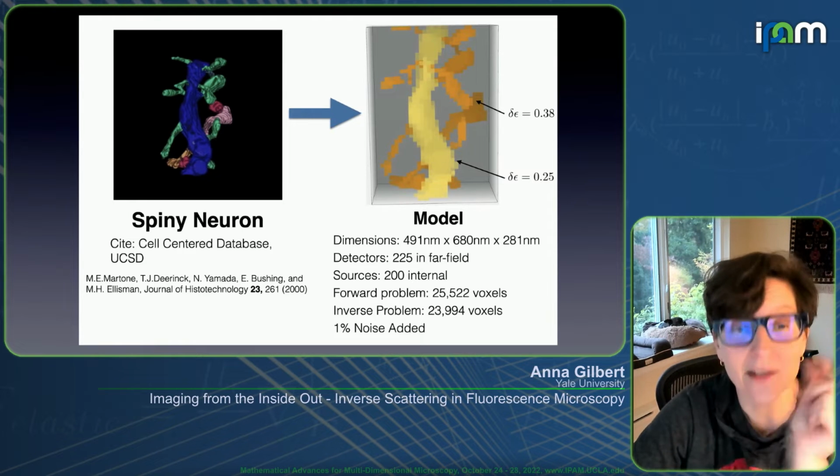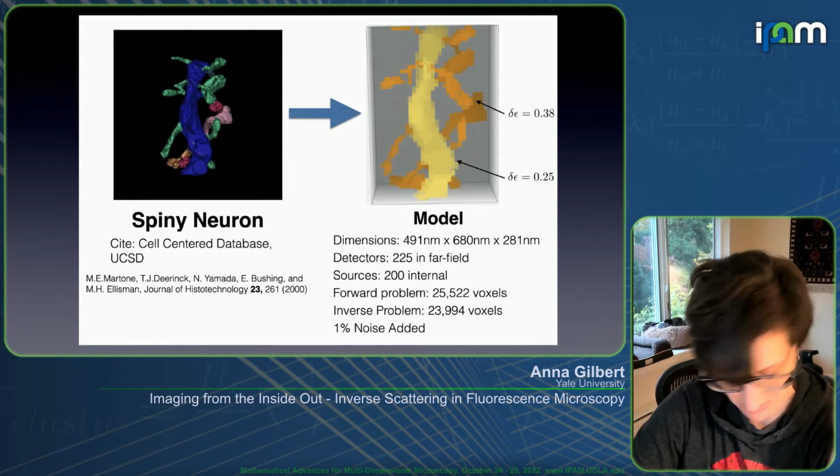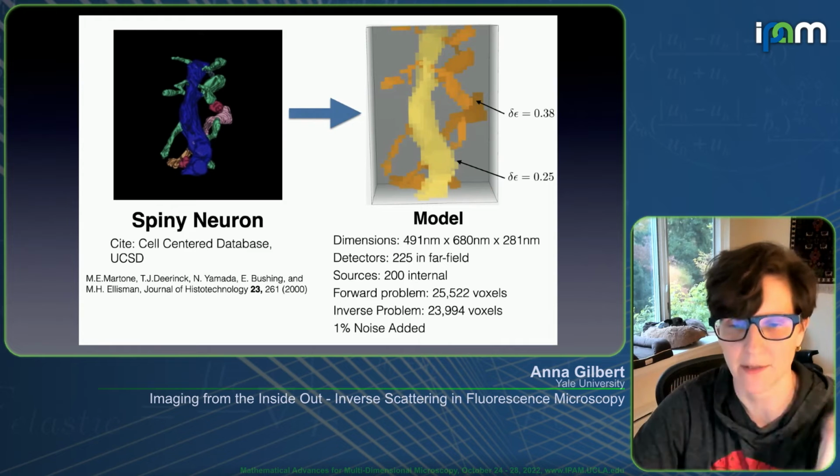And so that is the first paper that we did, which is place a bunch of sources and reconstruct the susceptibility. Okay, reconstruct inside the medium.